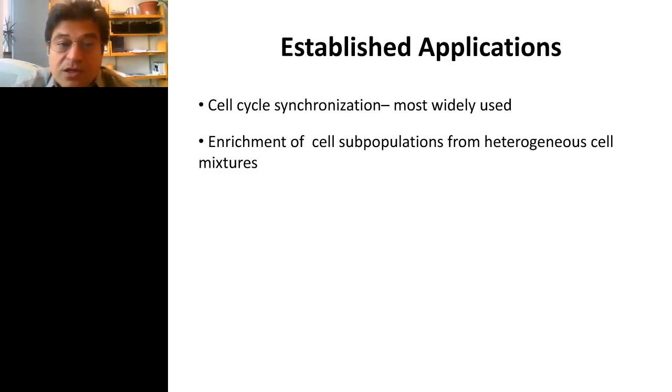We've actually started to do that. So these established applications are things that can already be moved into a core setting. This stuff has been well worked out. There are many papers, many cell types that have been looked at. So this is a number of applications that you could quickly move into a core environment.